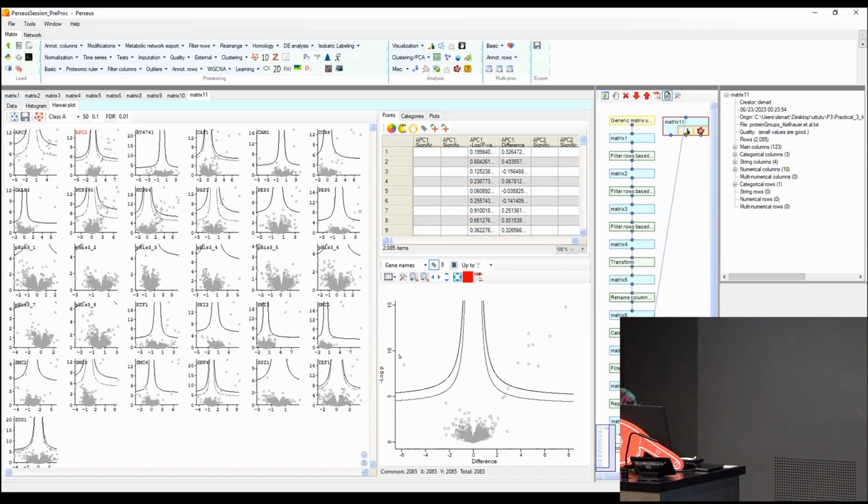Okay, yeah, makes sense. Thank you. Unless you have specific binding effects with the control, as you had with this histone as control that Carlo was showing, then you would expect even more on that side.